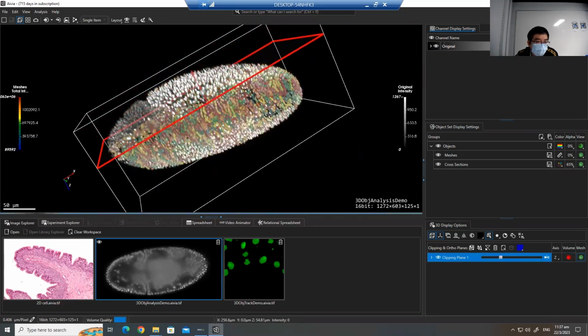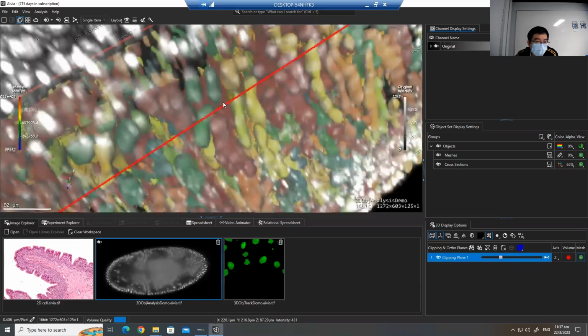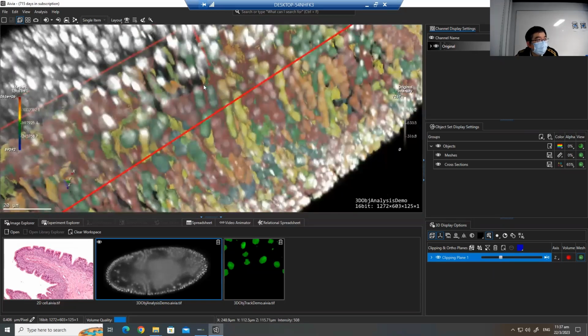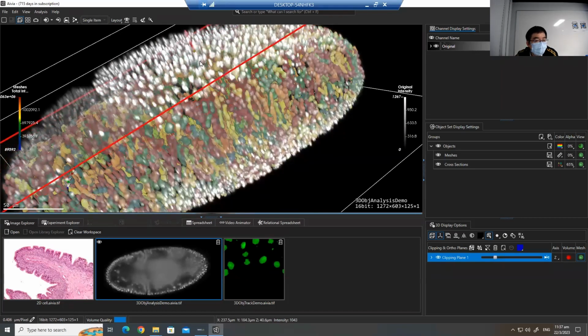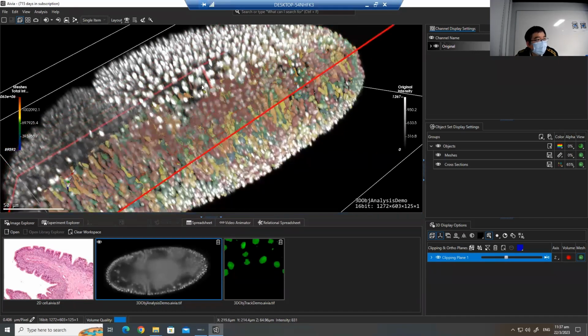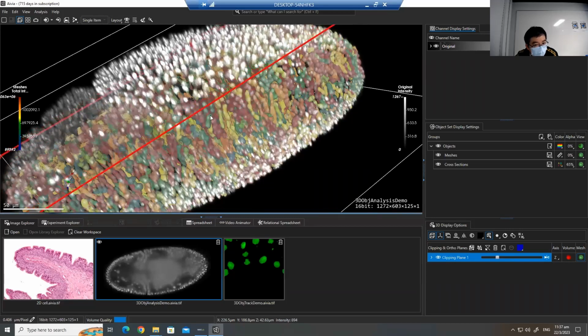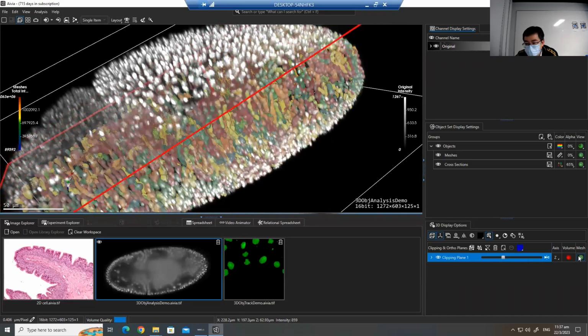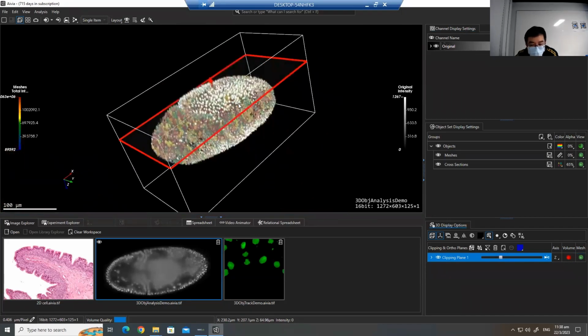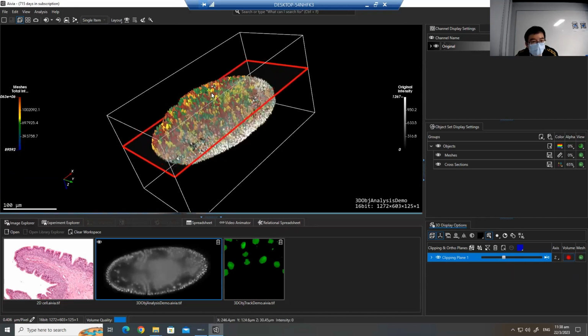This is a tool that might help you to check the accuracy of your measurement. So you can overlay your 3D or the original signal with the 3D model generated by the 3D image analysis. This icon here, if you disable it, you won't clip anything. You enable it, it's now clipping only the raw data, but not the 3D model.